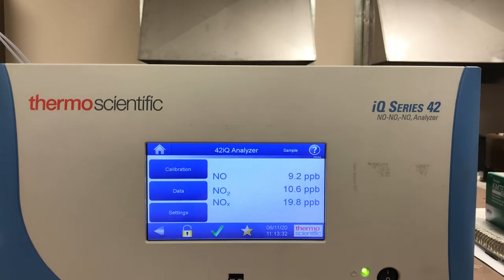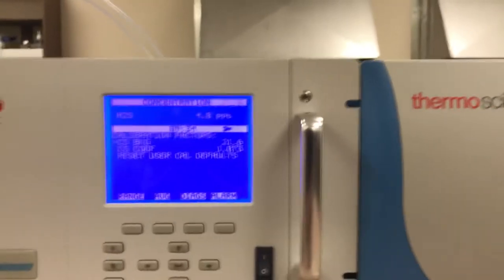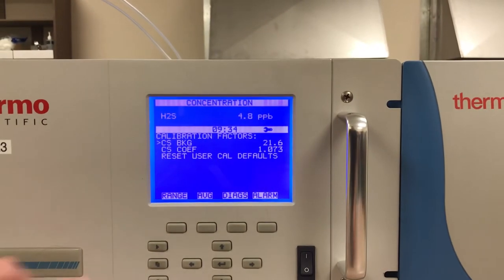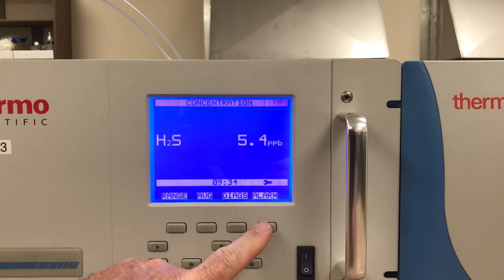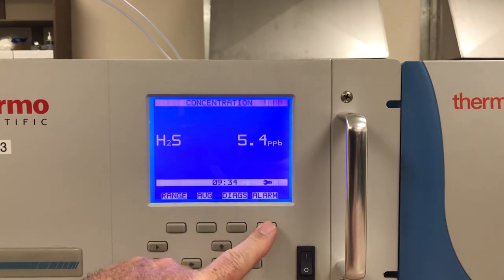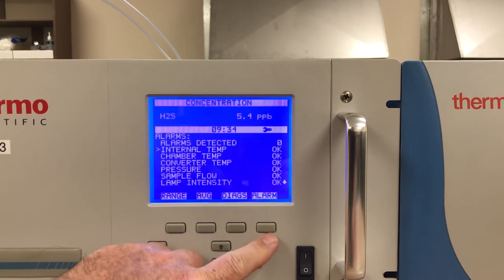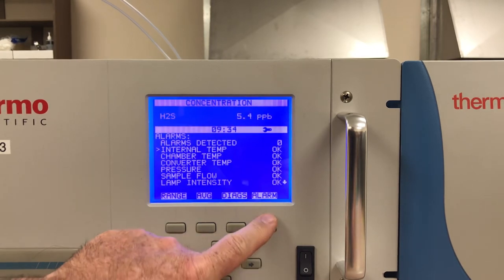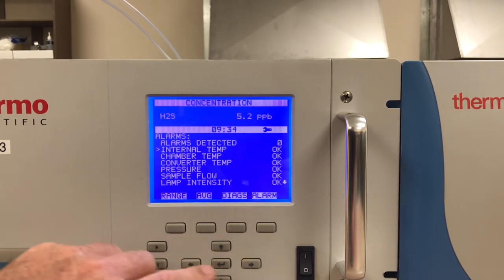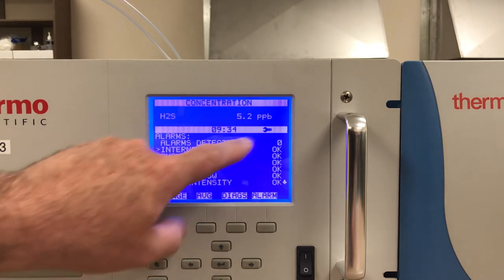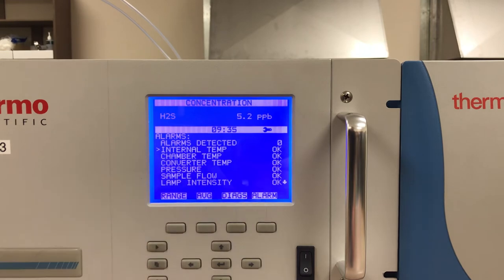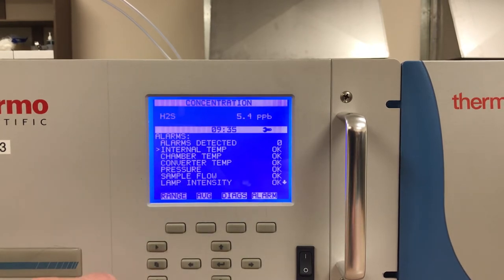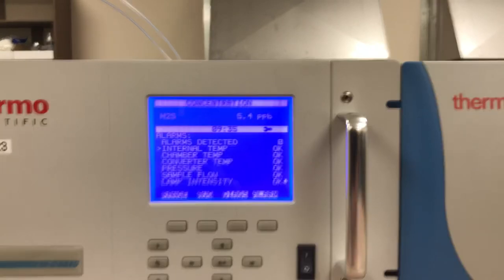Going back to the i-series — if we look at the alarms menu, they have the alarms right below. There's a button right below the alarm heading, and it will show me right away how many alarms are detected and whether they're okay — whether they're high or low temperatures, pressures, flows, or lamp intensity.